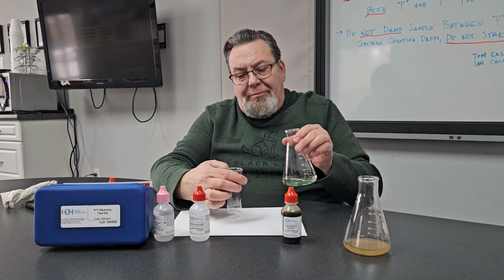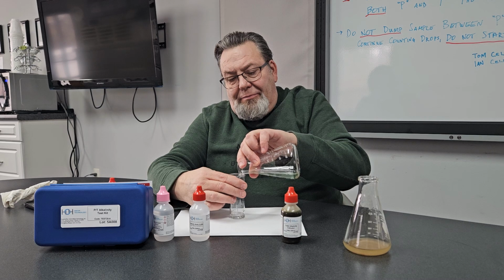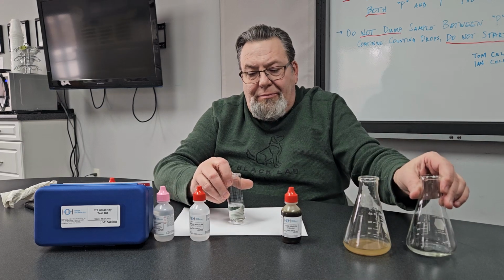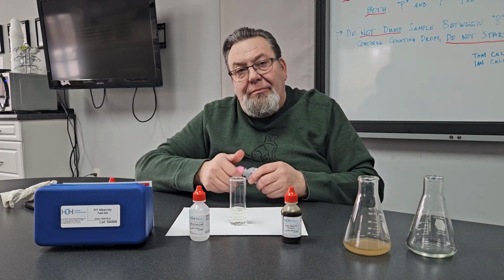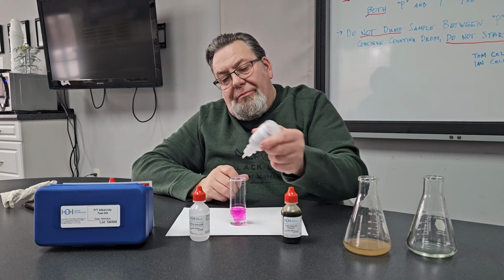You'll want to collect 25 milliliters in your sample vial. Please remember to rinse your sample vial before testing. This was already done. To the sample, we'll add 3 drops of the phenolphthalein indicator solution. If you add a drop or 2 extra, don't worry, it really doesn't affect the outcome of the test.